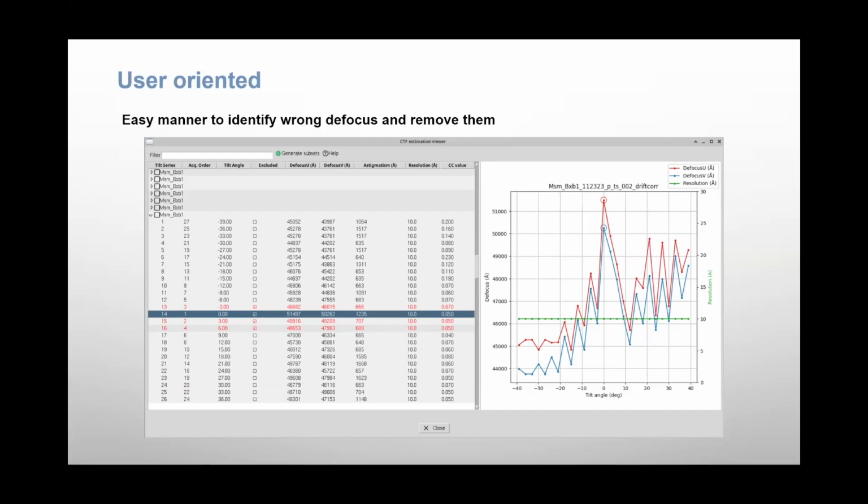At the moment in which, for instance, for a subtomogram averaging in Relion or for a CTF correction of the tilt series, the tilt series and the CTF are combined, the intersection of both sets is taken.